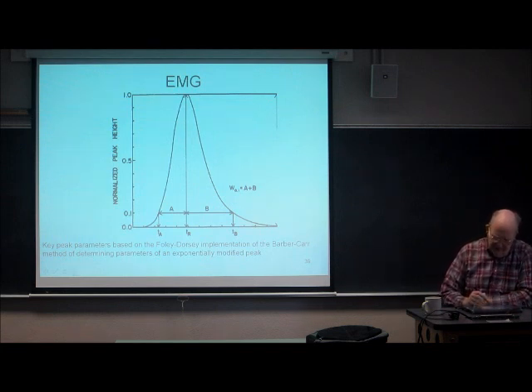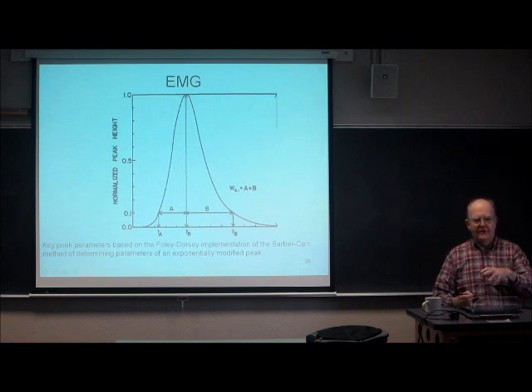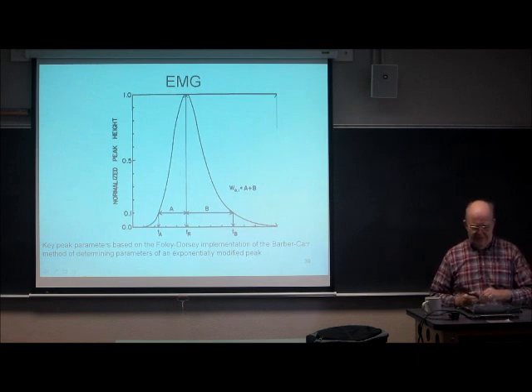And these two guys, John Dorsey and Rob Foley, came up with a really slick way of graphically, without a whole lot of messing around, a way to find out what the true value of the Gaussian contribution is and what the true value of the plate count is. Okay?